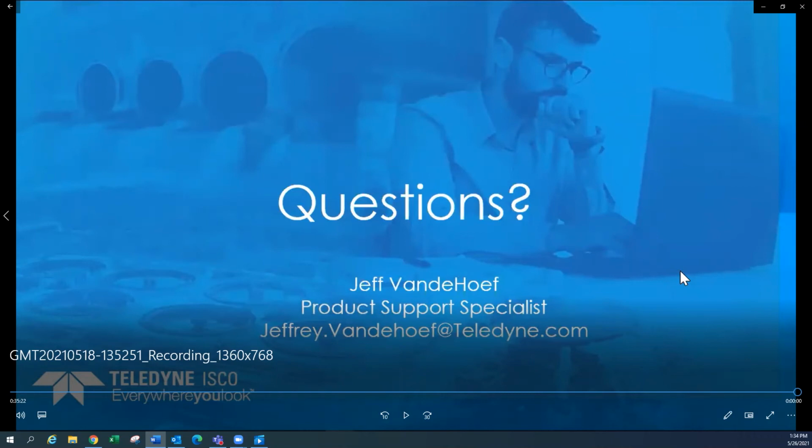Thank you. Our next question is, if the liquid level actuator stops seeing water, does the sampler program stop?